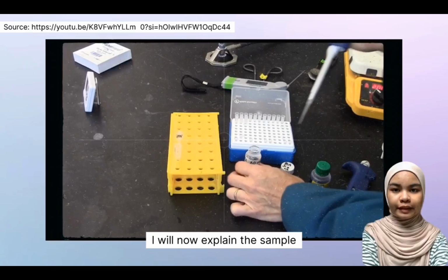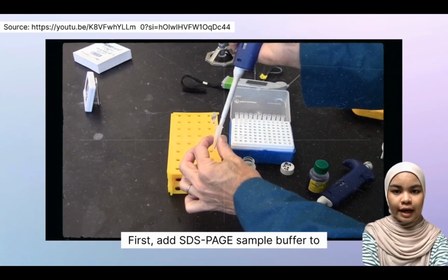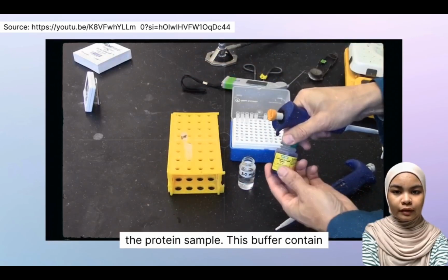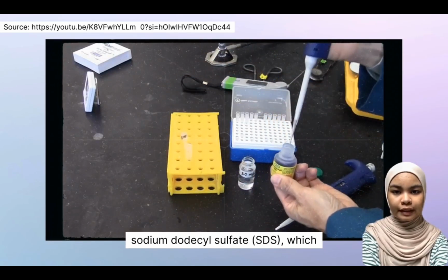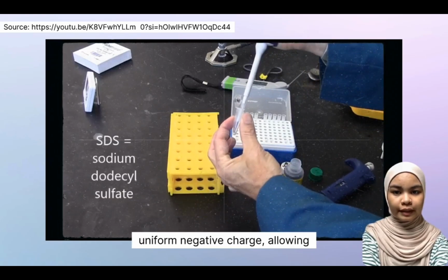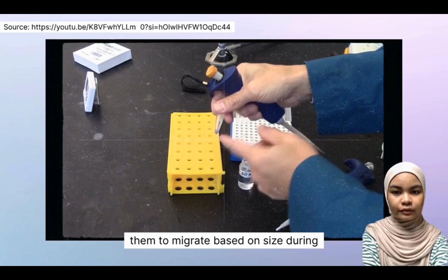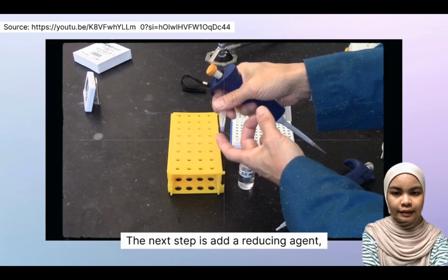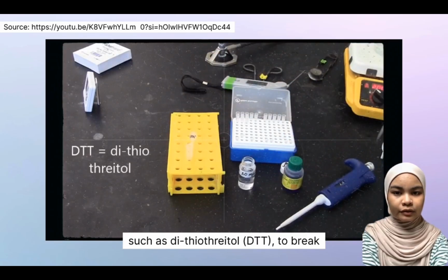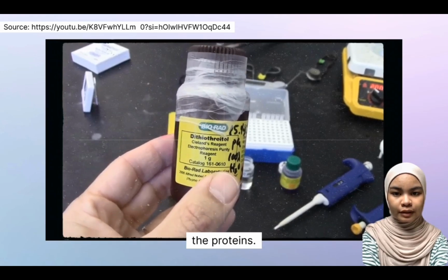I will now explain the sample preparation process for SDS-PAGE. First, add SDS-PAGE sample buffer to the protein sample. This buffer contains sodium dodecyl sulfate, SDS, which denatures proteins and imparts a uniform negative charge, allowing them to migrate based on size during electrophoresis. The next step is to add a reducing agent such as dithiothreitol to break disulfide bonds and further denature the proteins.